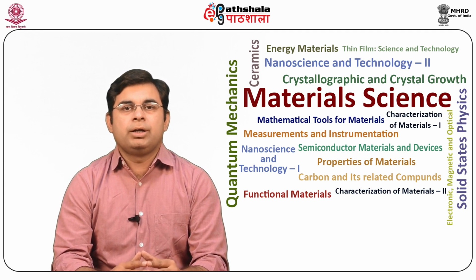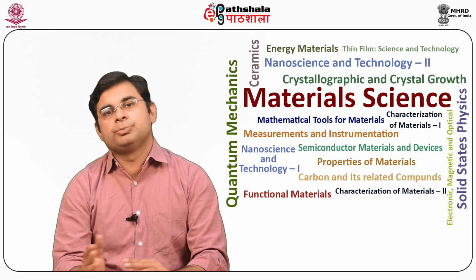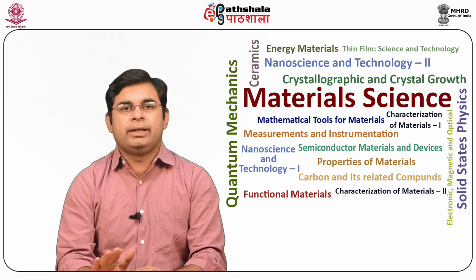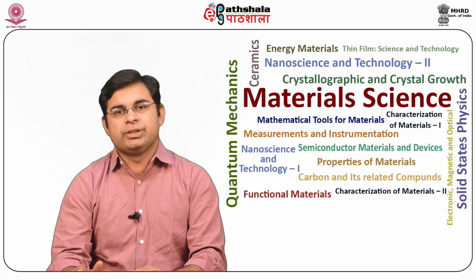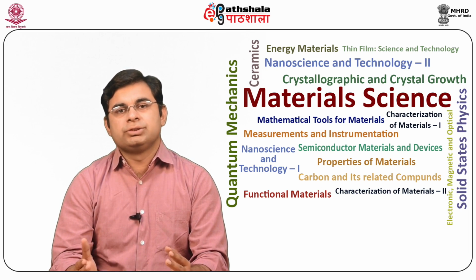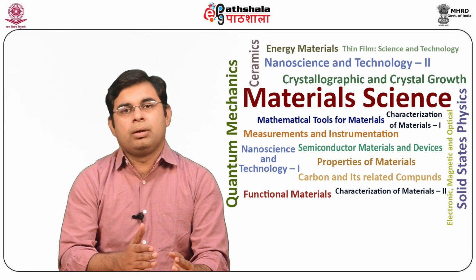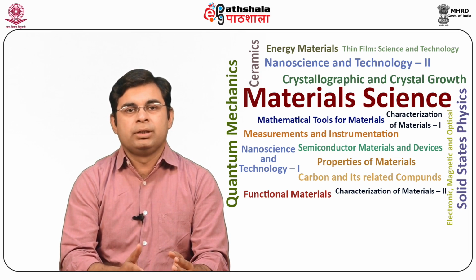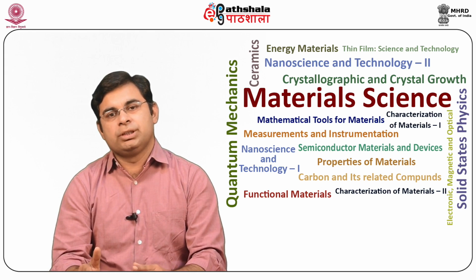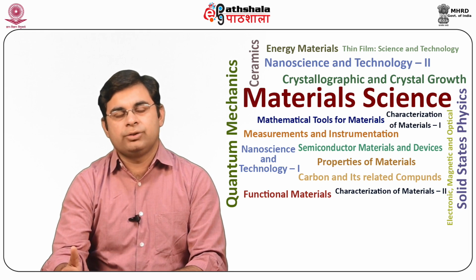Spectroscopic methods are a large group of analytical methods that are based on atomic and molecular spectroscopy. In general terms, spectroscopy is a branch of science that deals with the interaction of various types of radiation with matter. This field of investigation started with the studies involved in interaction of electromagnetic radiation and the matter, but at present the field has been broadened to include interaction of matter and other forms of energy. For example, acoustic waves and beams of particles such as ions and electrons.